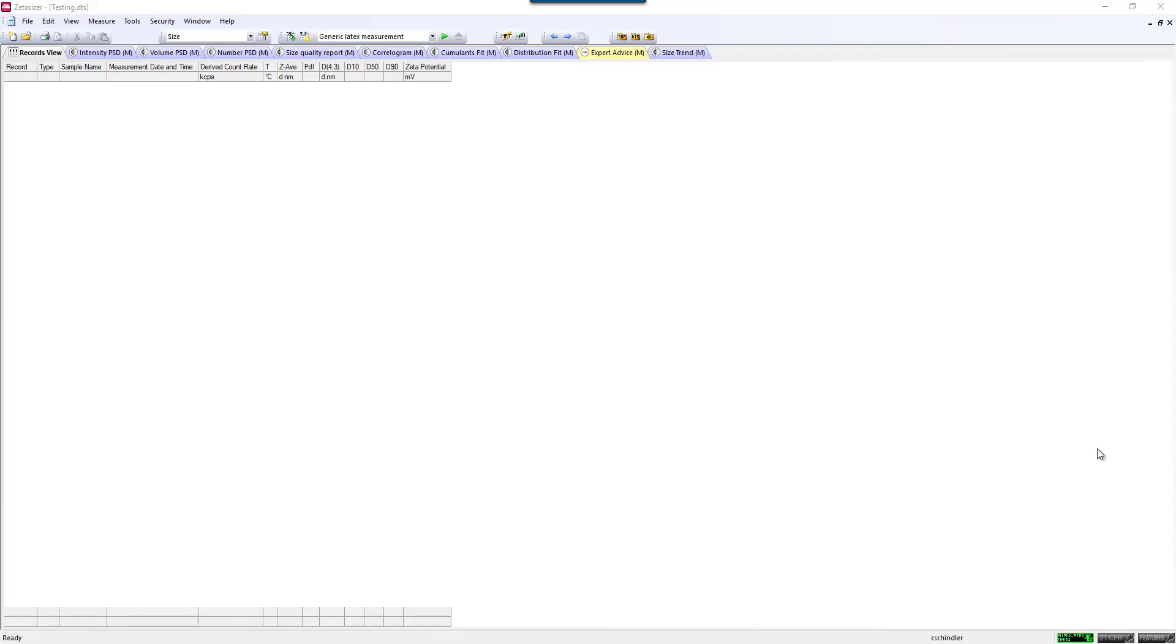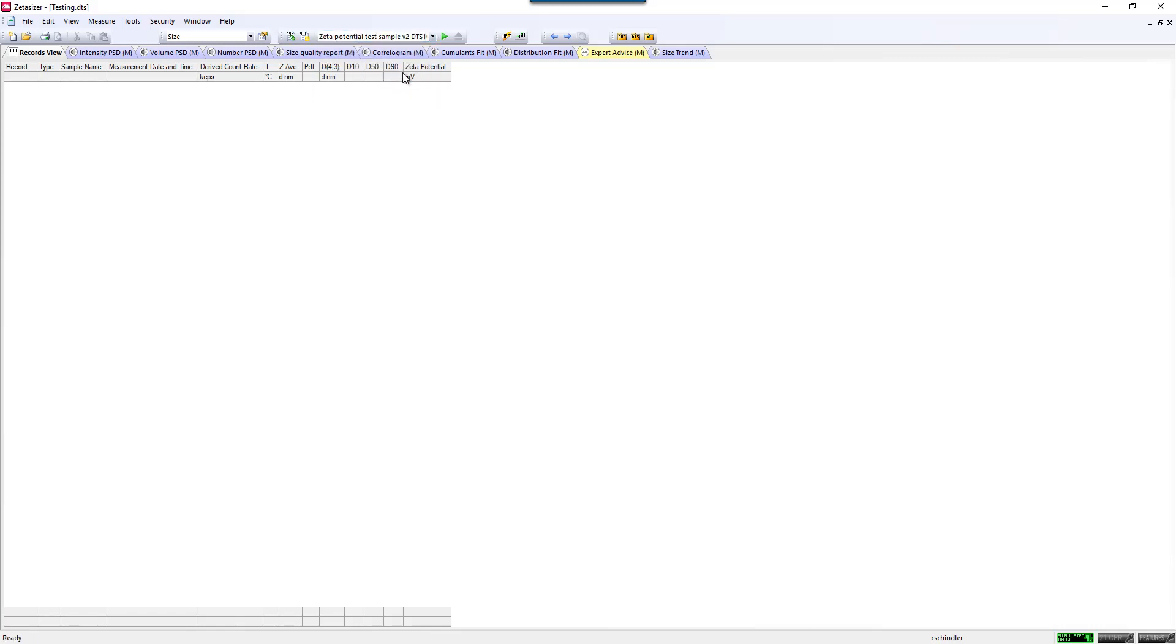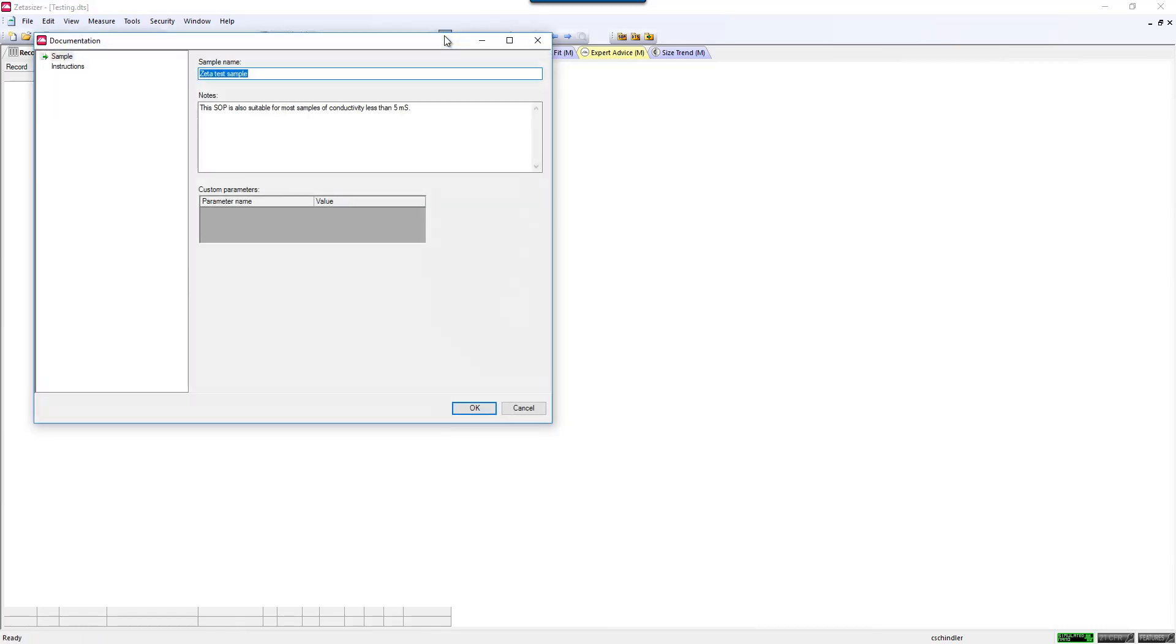This is a video showing briefly how to make a Zeta Potential measurement in the Zetasizer Nano Series software. Everything in the Zetasizer software works on SOPs, and so an SOP can be as simple as going up to this drop-down menu, clicking on a Zeta Potential test, and clicking Start.